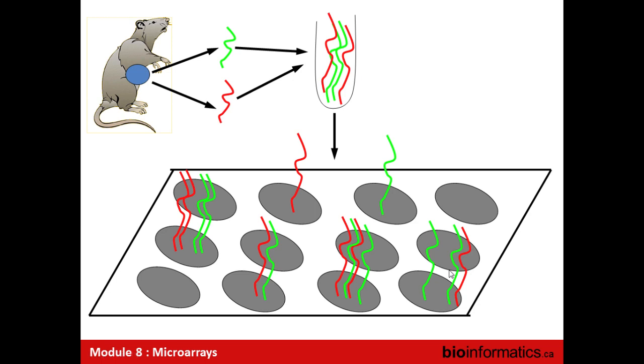About half or 60% of microarrays use a single dye. Those are primarily Affymetrix and NimbleGen arrays. And about 40% to 50% use two. Those would be things like Agilent arrays. And both technologies are perfectly viable.